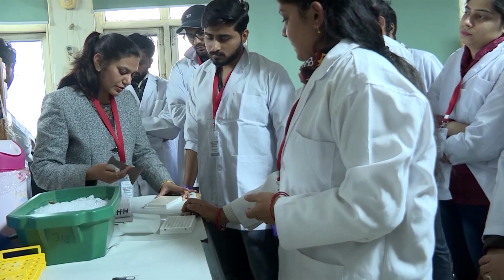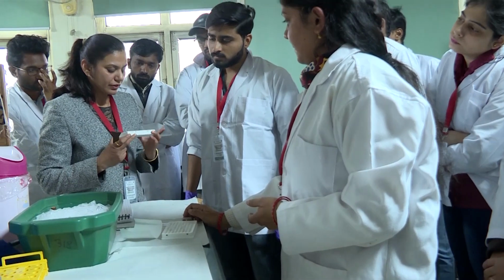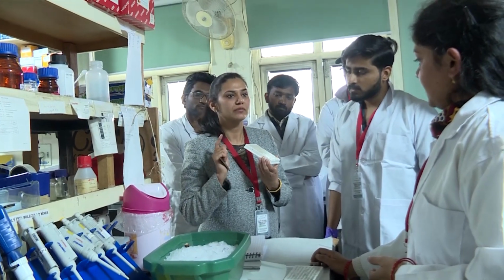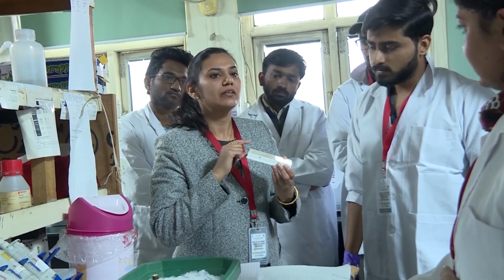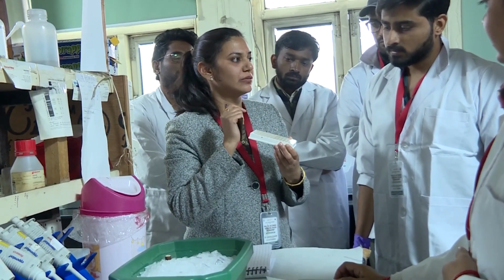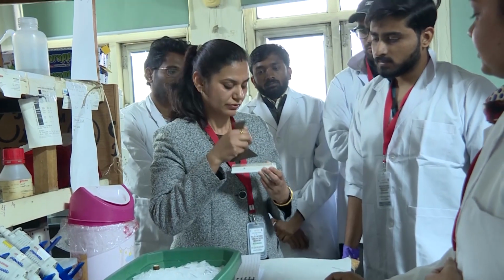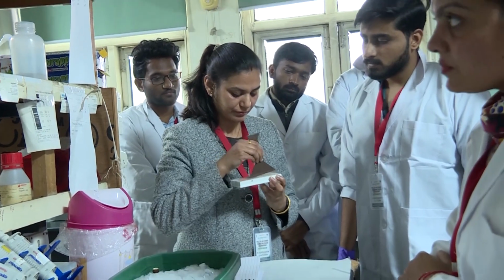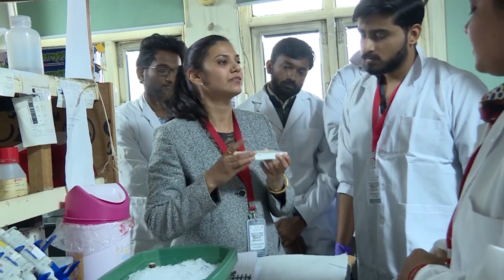Another idea is also why we should cover the complete plate, because this time we have used only 8 wells. The rest of the wells are fresh. So if it is covered, we can use this plate further also. The rest of the wells which are not used, we can use because they are not contaminated. Okay. So this plate is now ready.